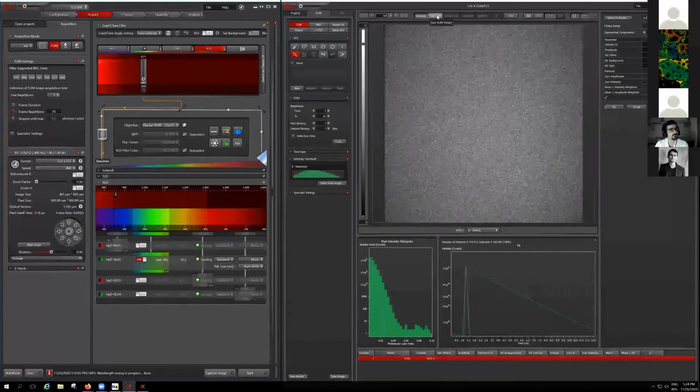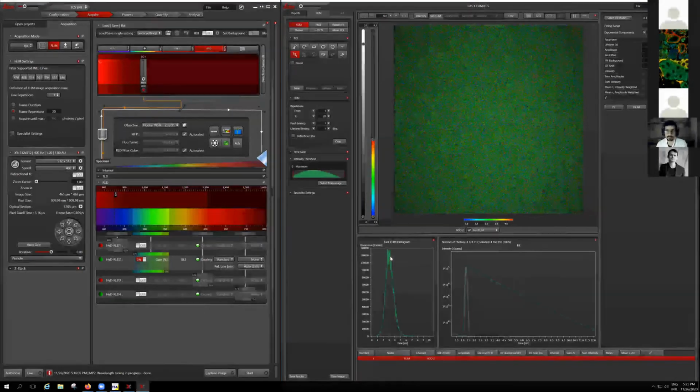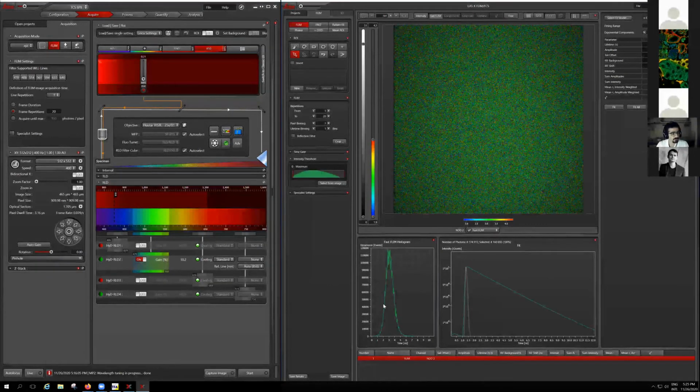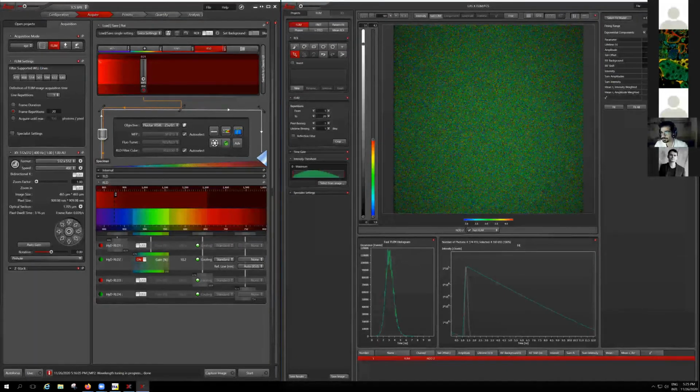I just moved to the fast FLIM image, and I'm expecting the fast FLIM histogram, which is showing the lifetime distribution across the field of view, how often this lifetime value actually occurred. This is the histogram of the fast FLIM lifetime, which is represented. And it's saying that there is a peak at something like three-something nanoseconds. As we talk about that, fast FLIM is a very fast estimation.